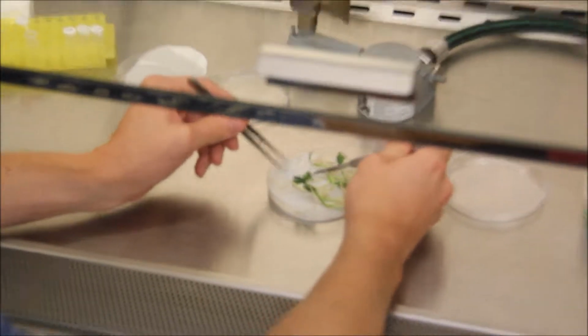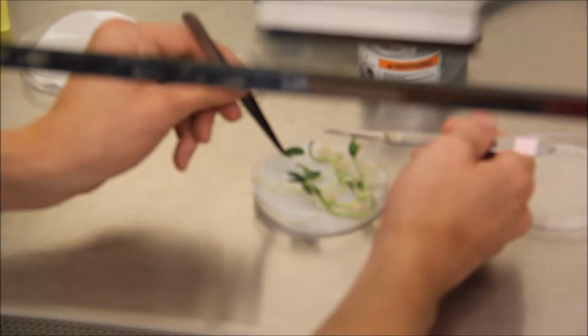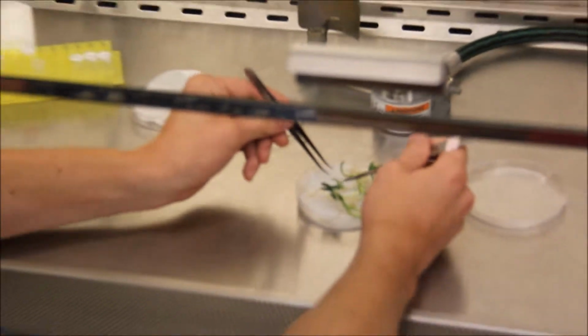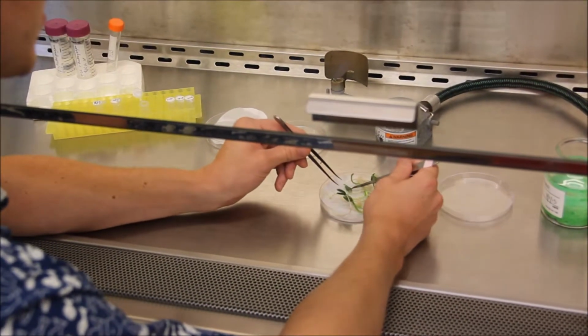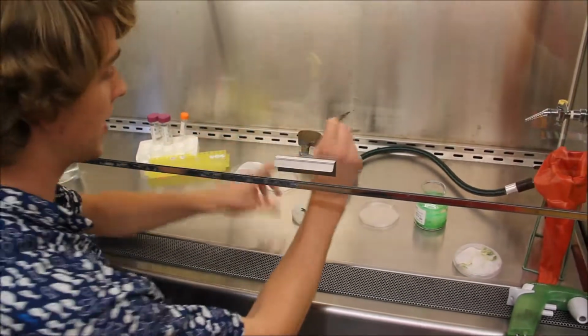And we now have 2 beans, but do not forget to remove this part that is trying to become a leaf, as that will interfere with your ability to generate. And you do it again for the other half. Oh, it's gone there. So now you can move them to your new plate. I like to do 2 per plate. It gets a little messy once they all start growing roots, and you have many cotyledons on one plate.